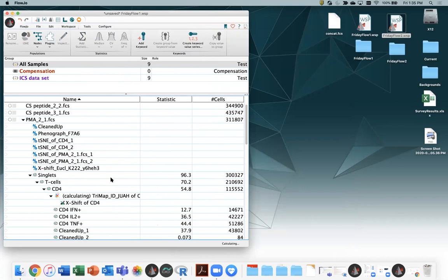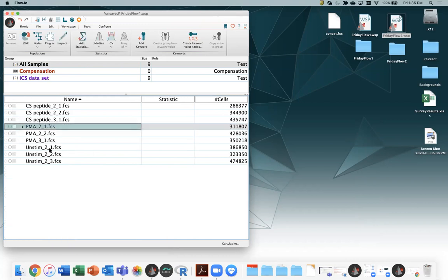I assume I slowed it down by resetting all of the other calculations going on. All right, while that is still calculating, the other thing to mention is that all of these clustering and dimensionality reduction tools are going to create fairly novel new sets of parameters or novel sets of cluster numbers. It is worth combining all of the data that you intend to do some work on.